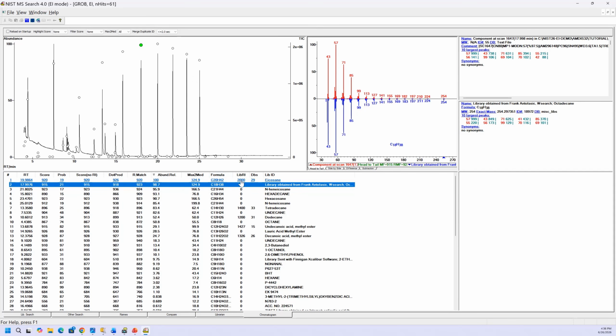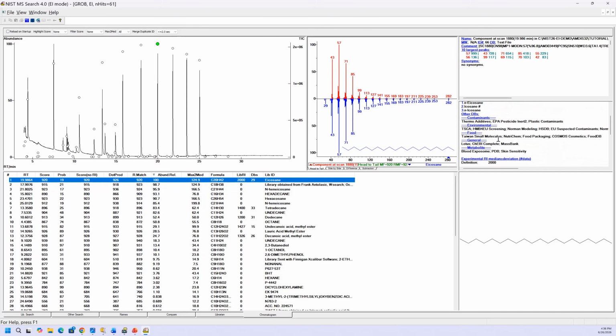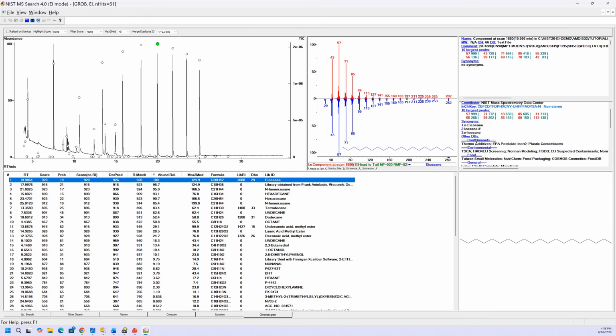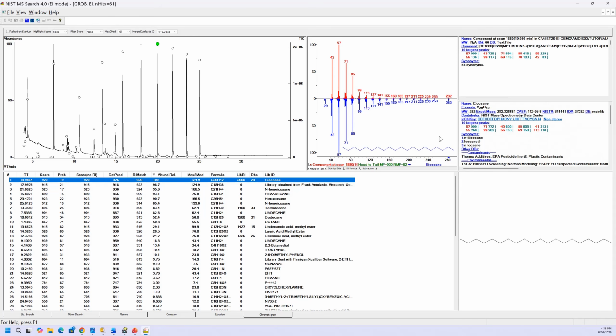And then it also has other information like the databases it's in. If it's in a lot of databases, that's a good indication that it might be a reasonable structure. And the databases, you can go up here, you can see which ones it's in. It's in a lot of different ones here if you scroll down and look at them. So I'm looking up here at the top.